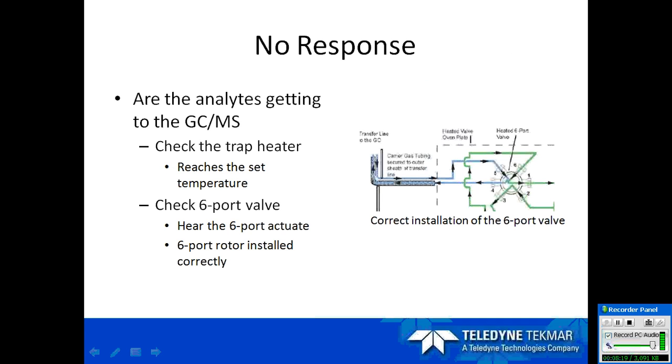First topic that we're going to be talking about is no response. This can be broken down into a couple categories here.